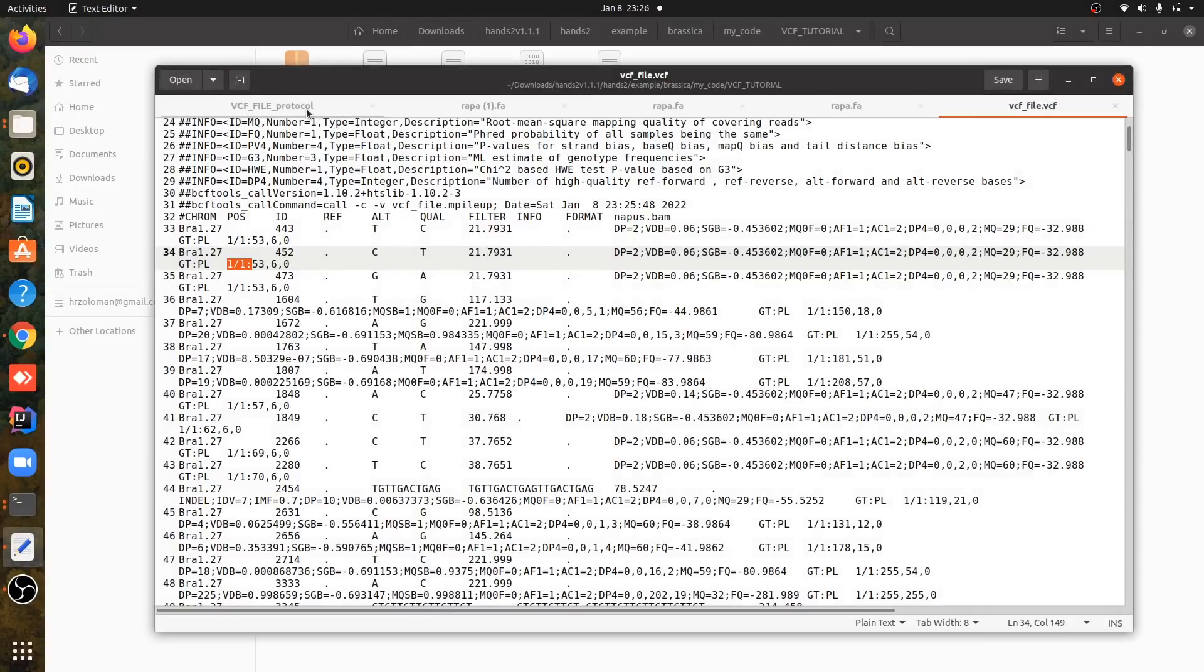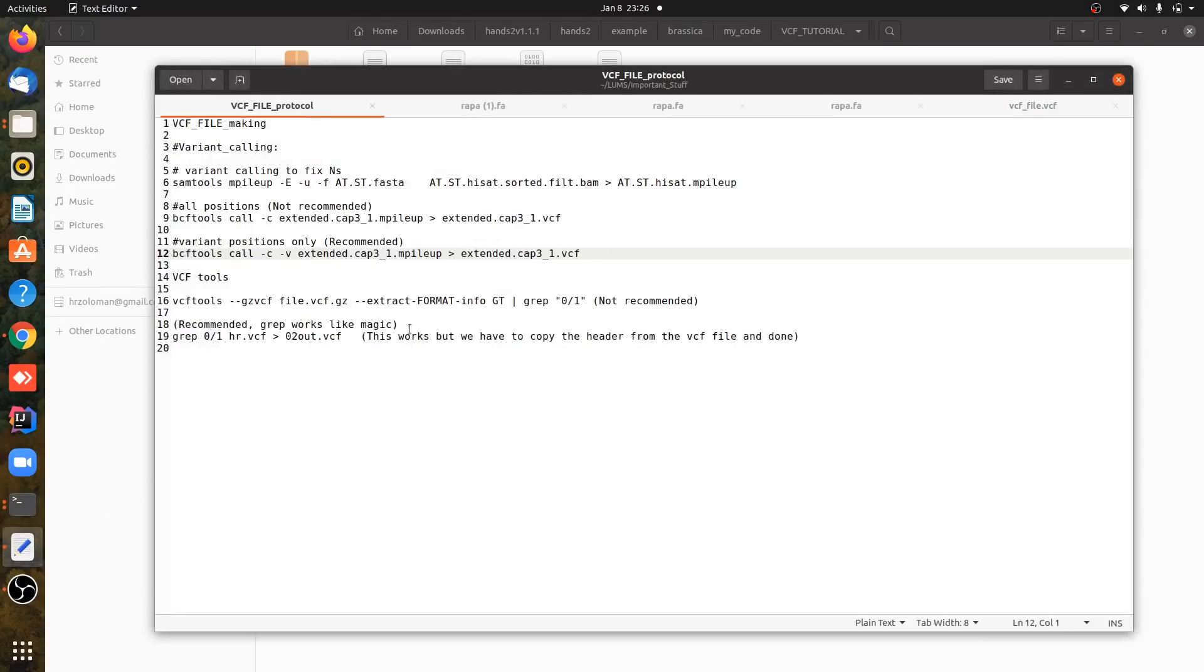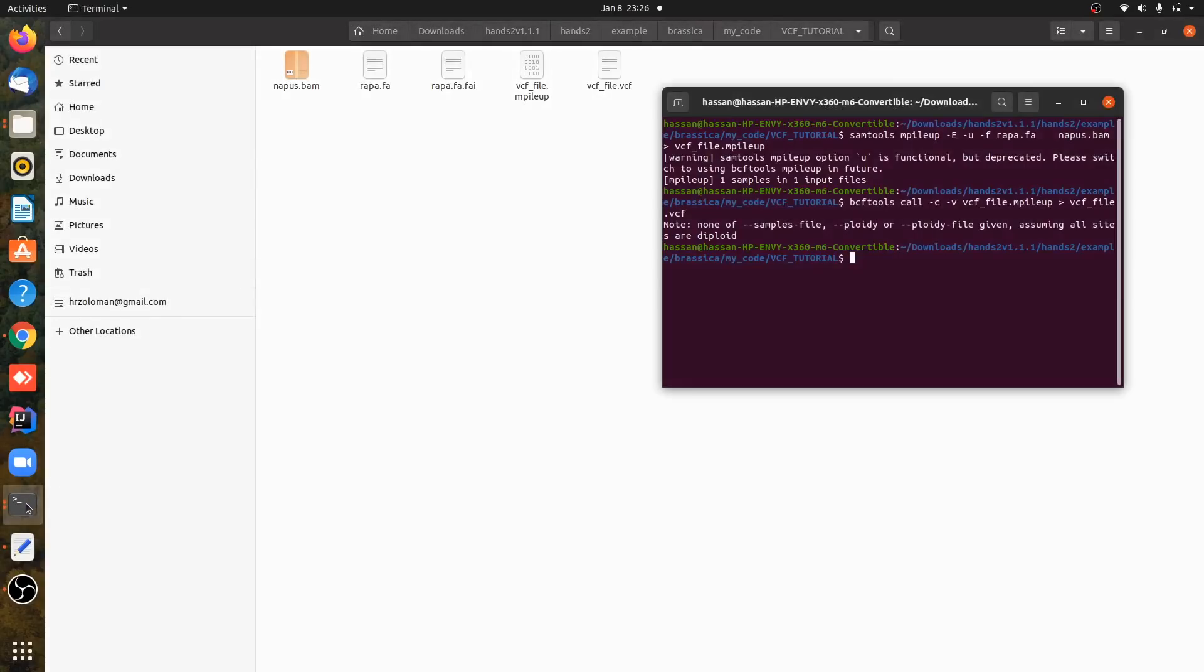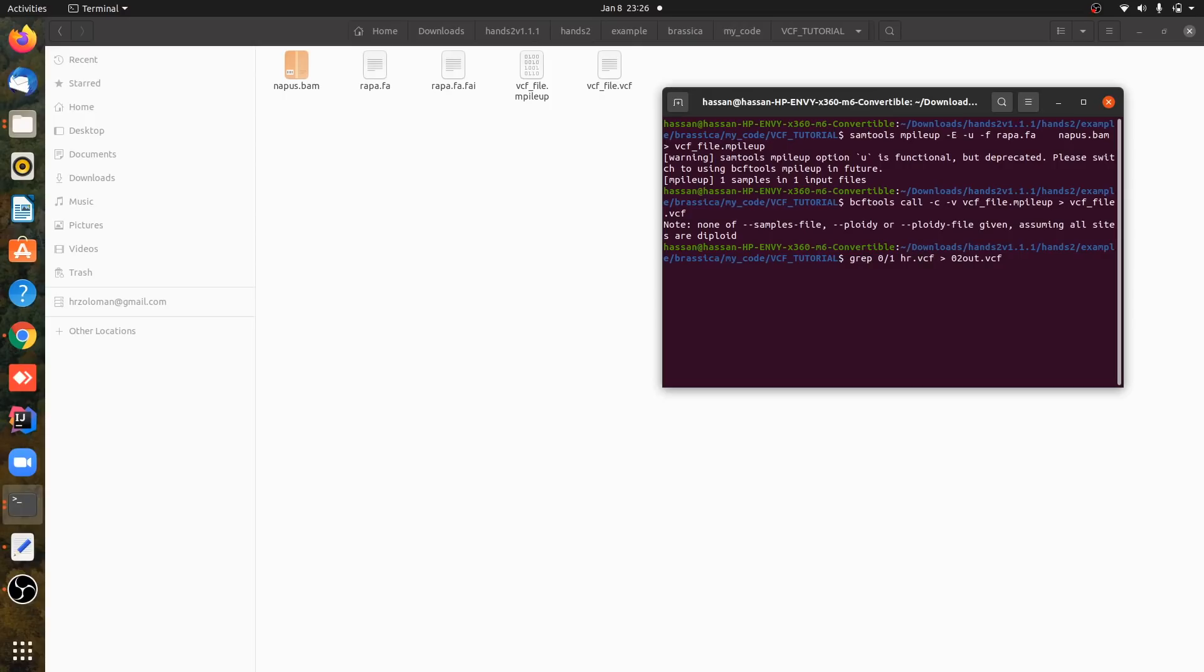Just by writing the grep command, this will work and we will get VCF positions. So VCF file.vcf, and it will give us the final VCF file, final VCF, which will have only heterozygous positions.